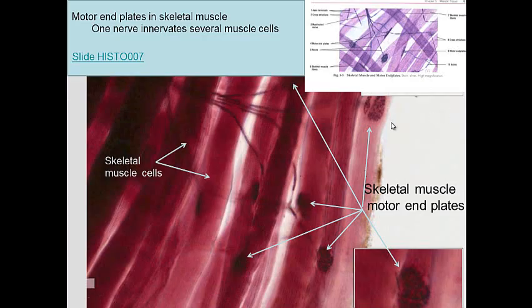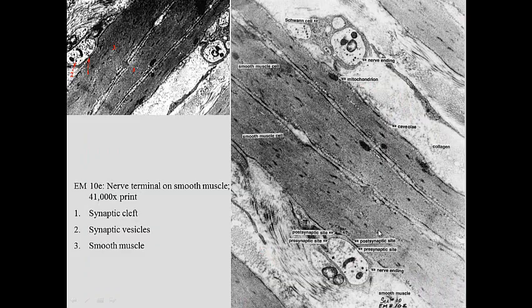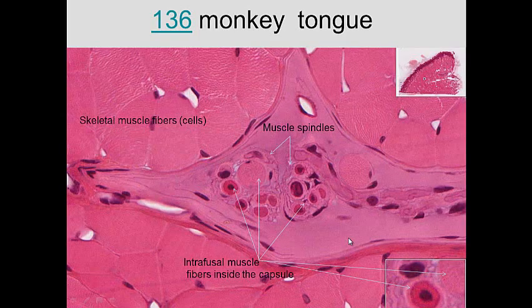We saw this before — this is a motor end plate where a nerve comes in and innervates various skeletal muscle cells. Various nerves: a nerve comes here and interacts with various skeletal muscle cells — one here, one there, one there — and then we can see the motor end plate. If we look at smooth muscle cells, we can see a synaptic cleft where the axon synapses. The vesicles we see here carry neurotransmitters that would stimulate the smooth muscle to contract.